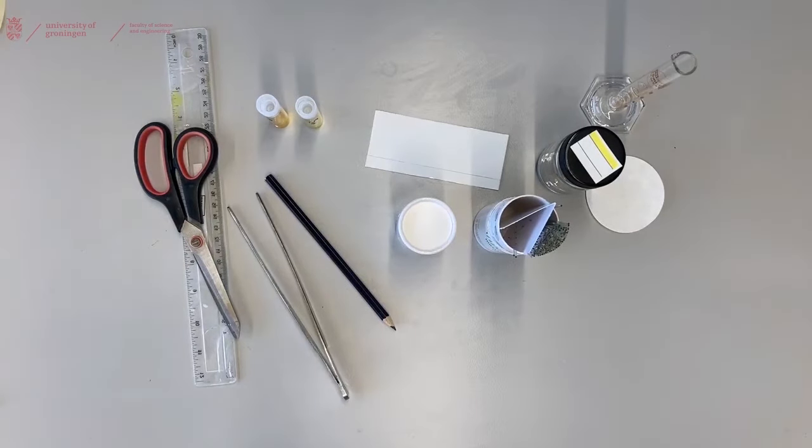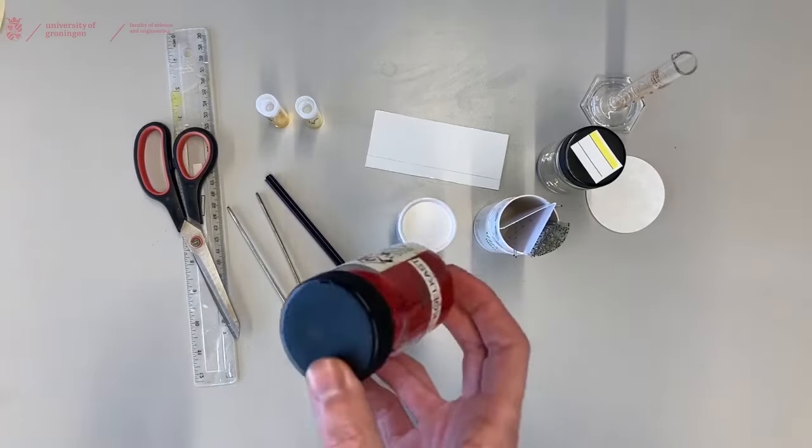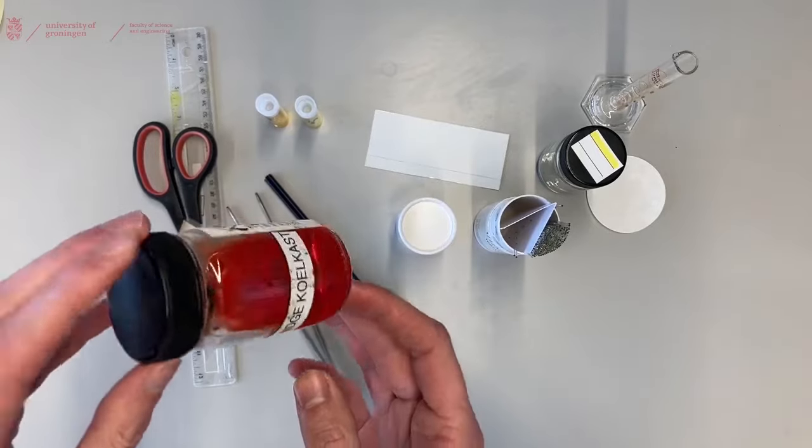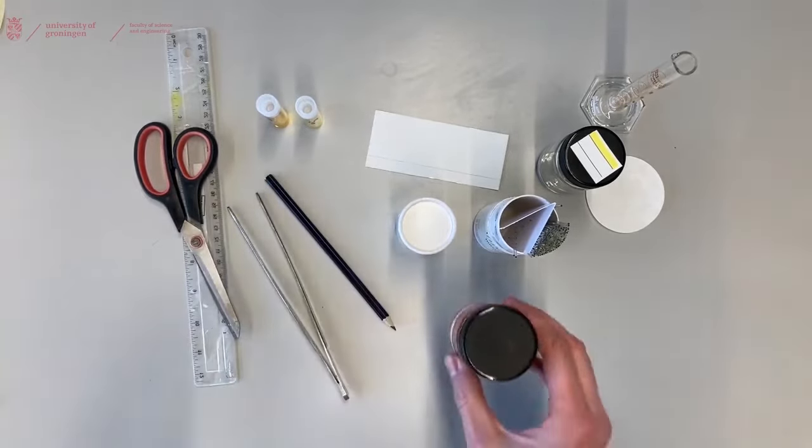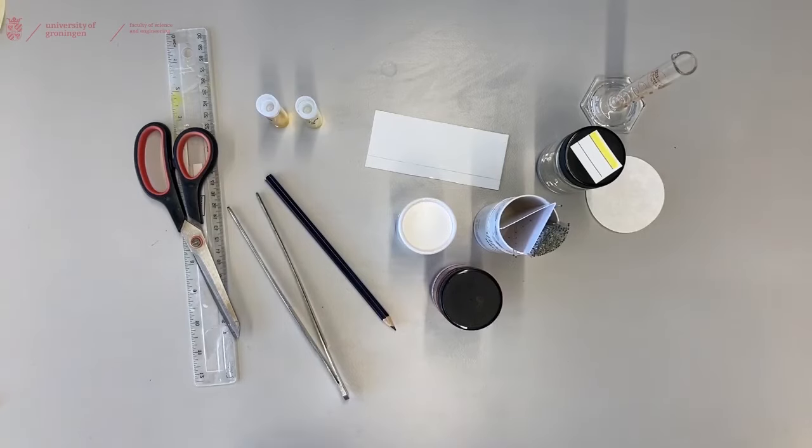You'll need a scissor to cut your TLC plate to size. And generally you will need a visualization agent that can be a stain, in this case anisaldehyde. It could also be that you can use a UV light or that your product is just visible by the naked eye.